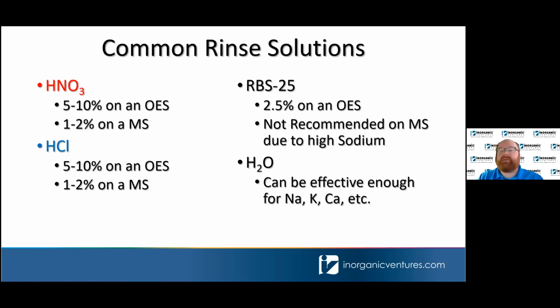And then finally, we do use water, of course. It can be effective enough for some of the major elements like sodium, potassium, and calcium. We typically are using water for the auto sampler probe in the rinse station. So it's still a rinse that we use. It's just maybe not for the entire rinsing protocol.